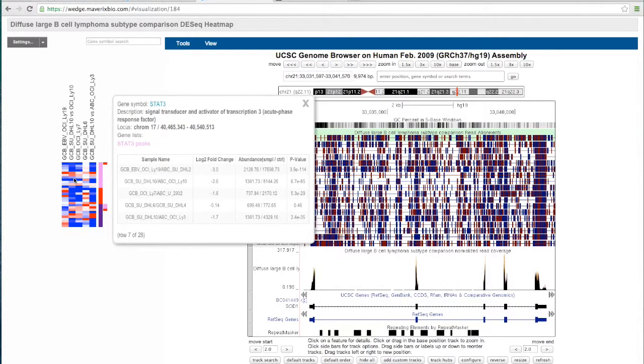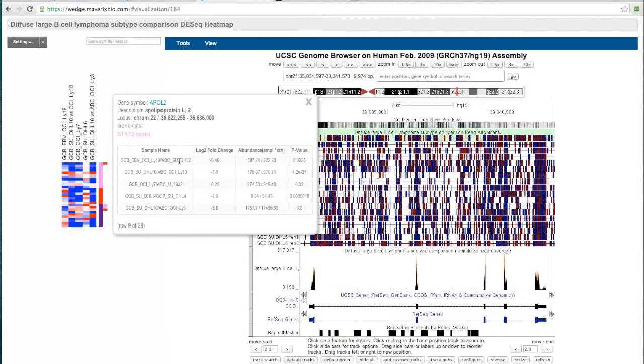And of course, as you hover over these, you can actually see which samples are being compared to which reference sample. But this really gives you the ability to customize the heat map and gives you that flexibility both in terms of sorting, filtering, and being able to quickly hone in on the set of genes that you want to look at by using the gene list feature.